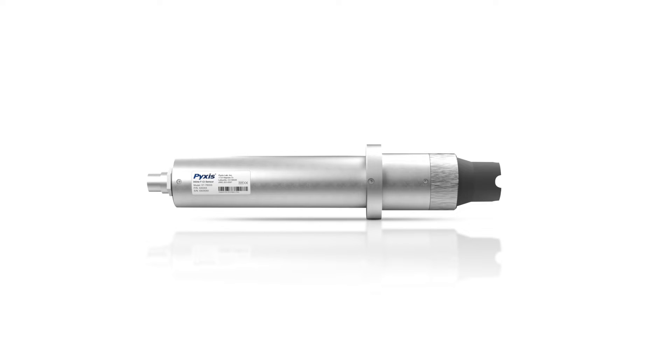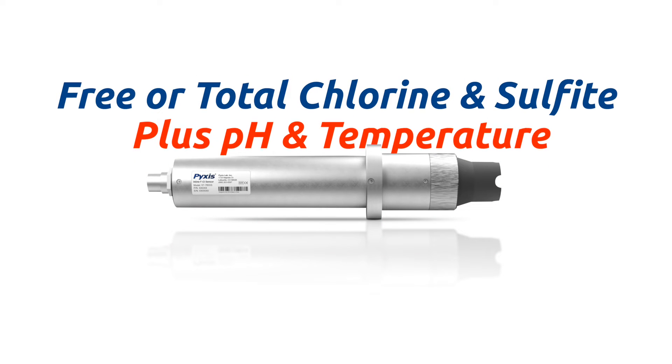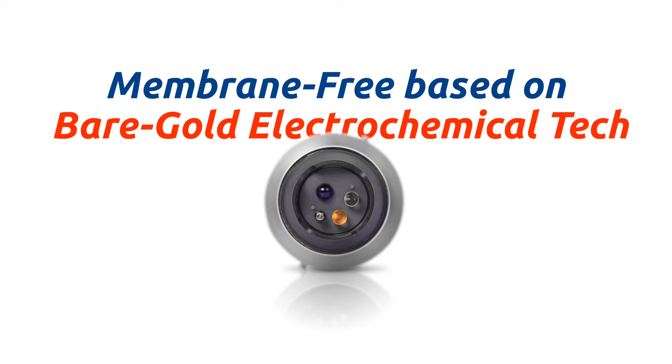At the core of the IK765 DCL is the ST765 series smart sensor design, available in free or total chlorine and sulfite plus pH and temperature. The ST765 sensor is membrane-free and based on unique principles incorporating Pixis' advances in the field of bare-gold electrochemical detection.